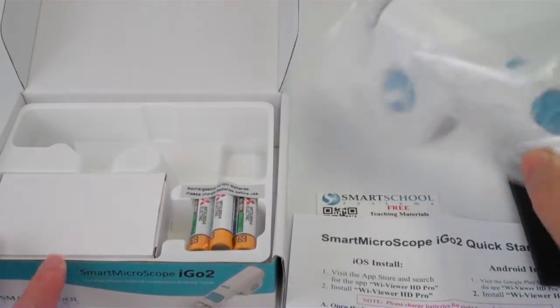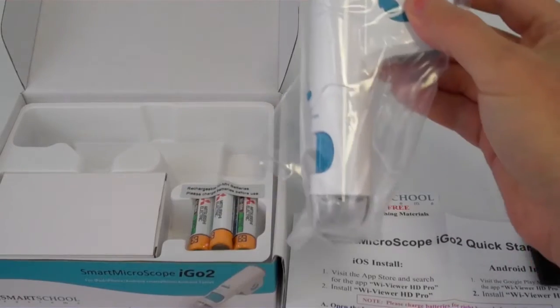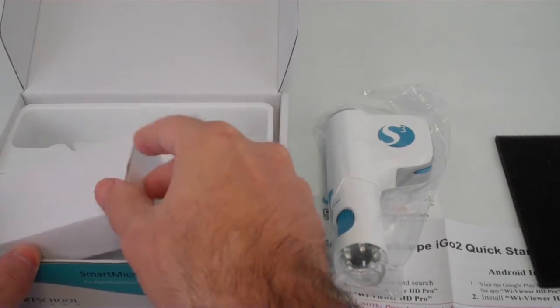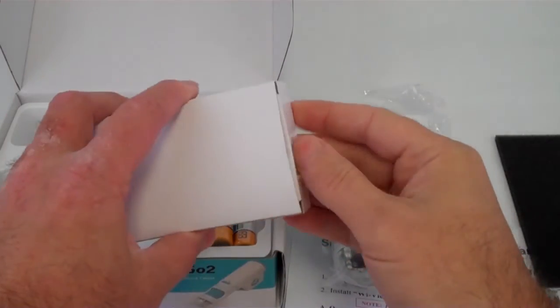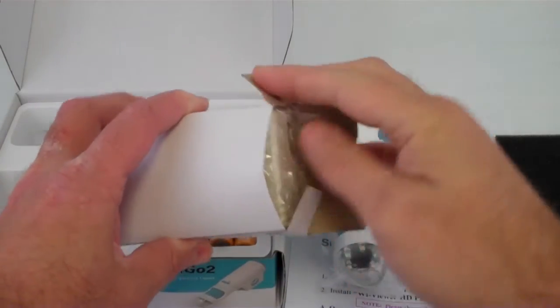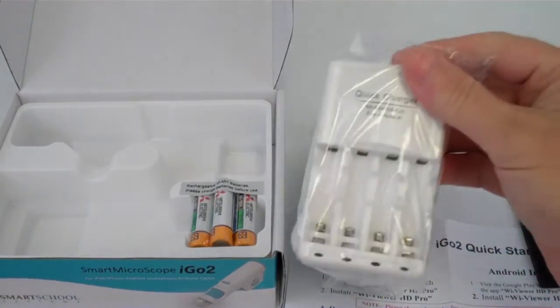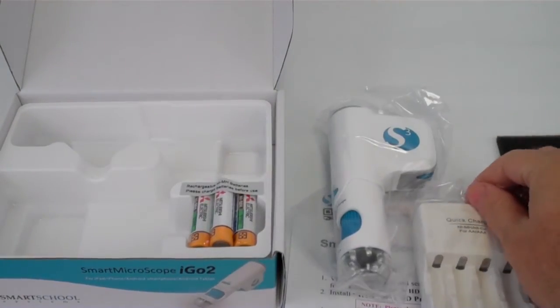You'll find the iGoTo along with the battery charger and the batteries. The iGoTo comes with three AA batteries and the charger for them.